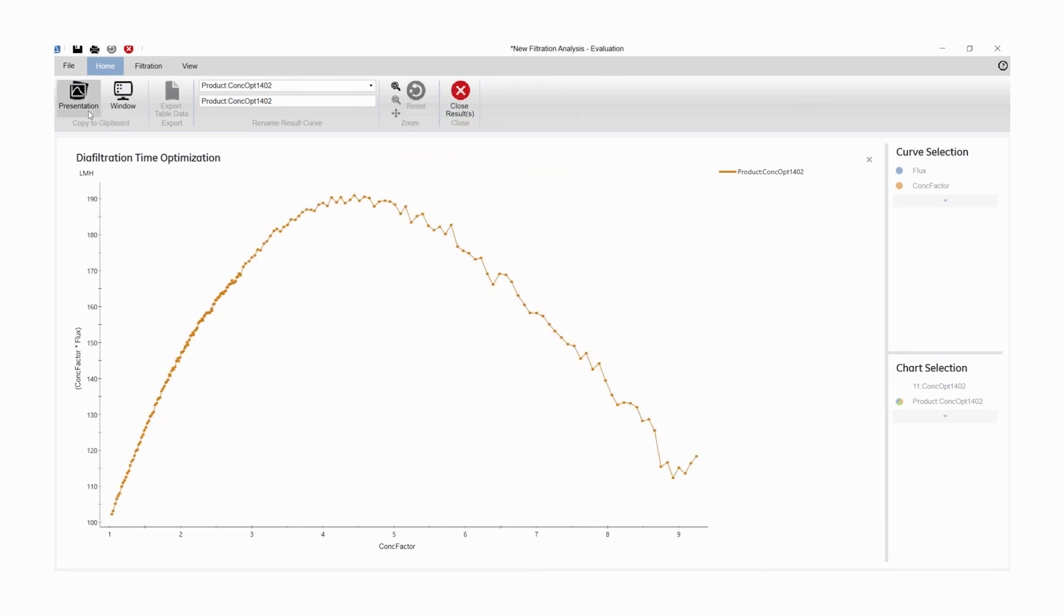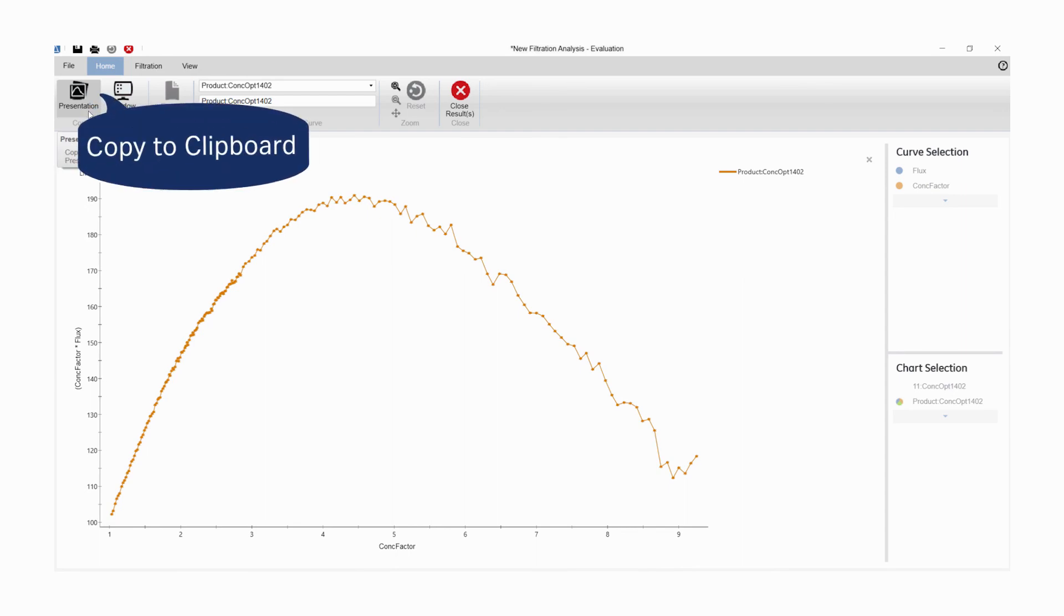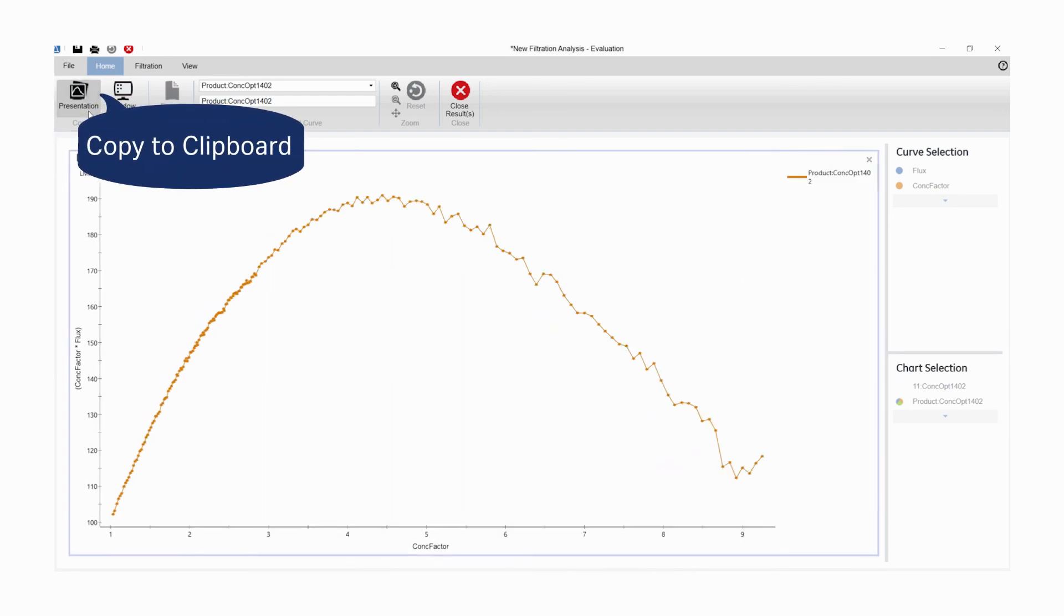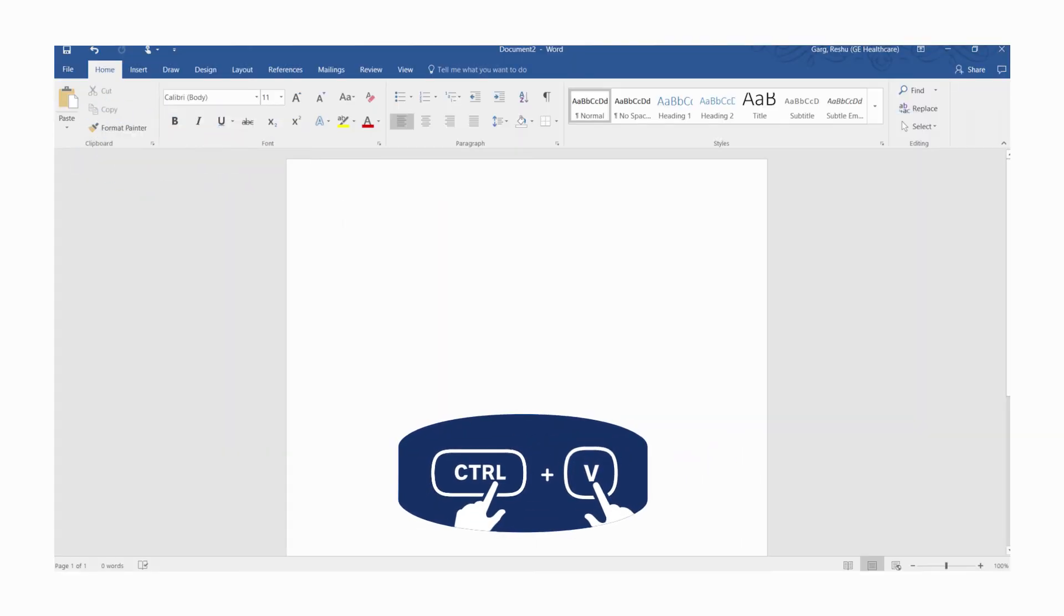If you wish to share your results, it's easy. Just copy and paste your results into your application.